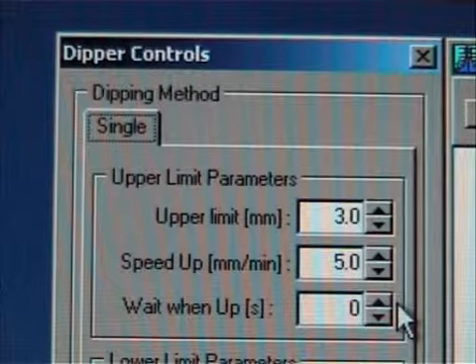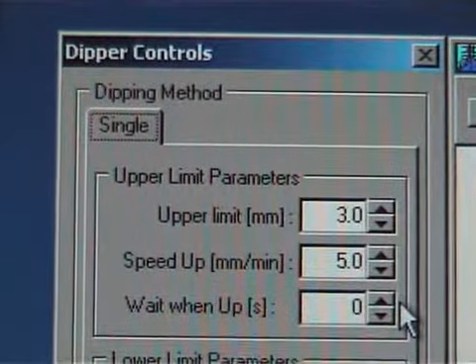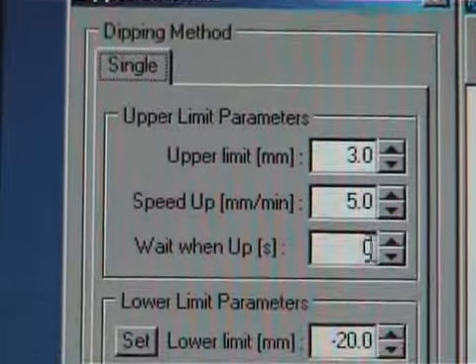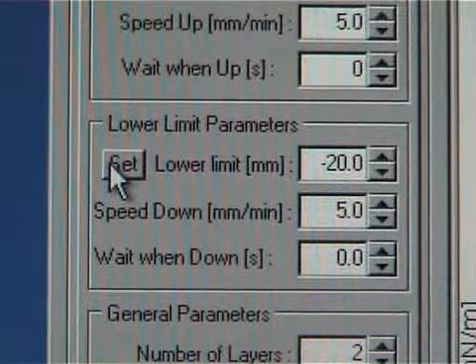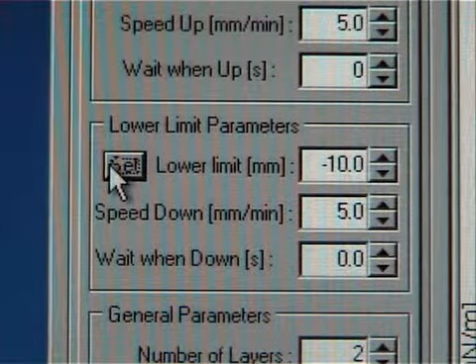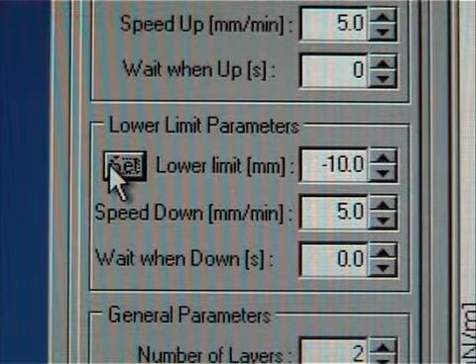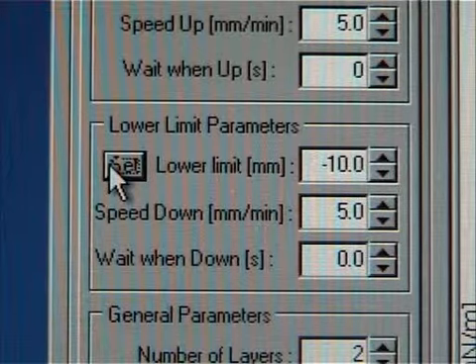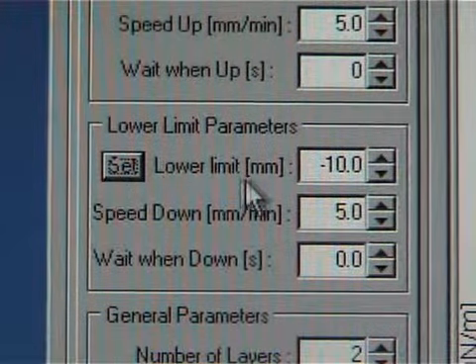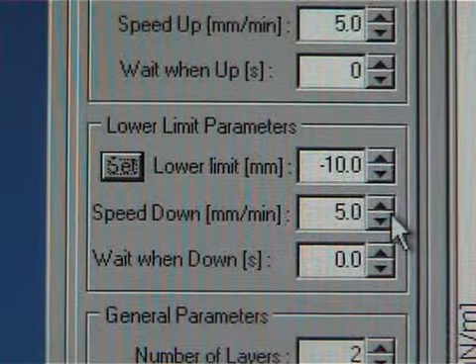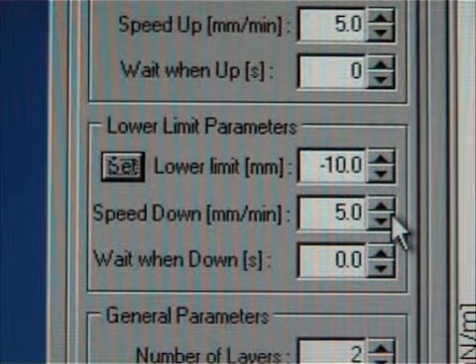It is important to make sure that the sample is really dry before dipping it again to the subphase. The lower limit can be set automatically by pressing the set button. Then the dipping arm's current position will change to the field. If the dipping is started from air, the dipping depth has to be changed manually. Usually the speed down value is the same as the speed up.